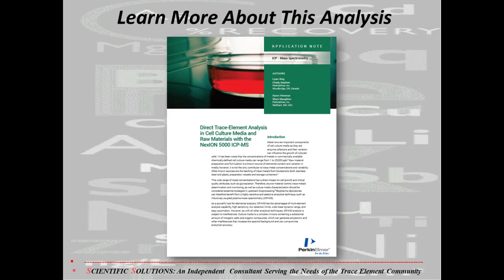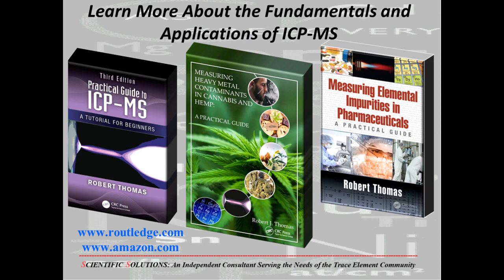Hopefully, in my limited amount of time, I've given you a flavor of the potential of multi-quadrupole-based ICP-MS to carry out this very challenging analysis. If you're interested in learning more, you should check out this recent application note from PerkinElmer.